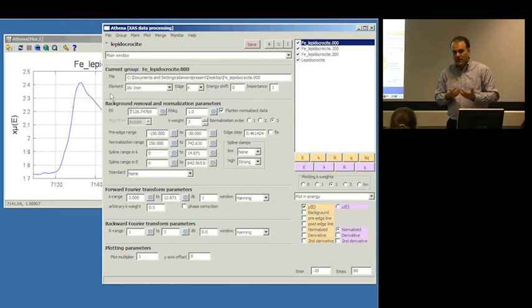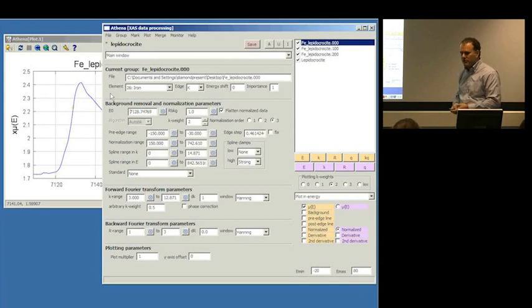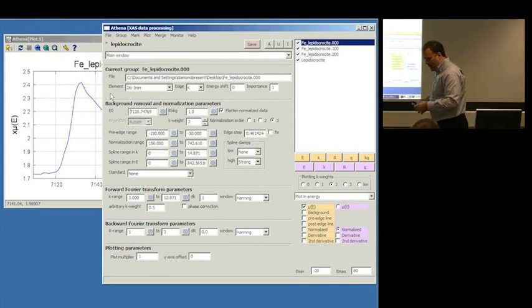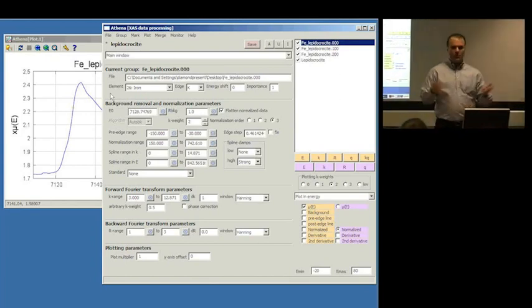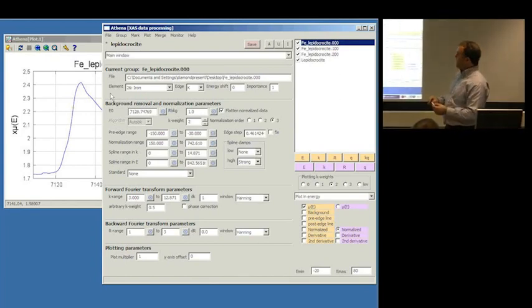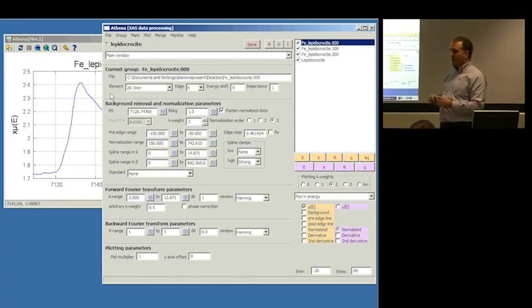So you might need to think about what E0 should be for every item in an ensemble of data. The other thing is that E0 is the zero of K, and as we'll talk about tomorrow, and as you may have already seen in your wanderings through XAFS so far, when you do the data analysis in Artemis or a similar program, there's a parameter for shifting E0.